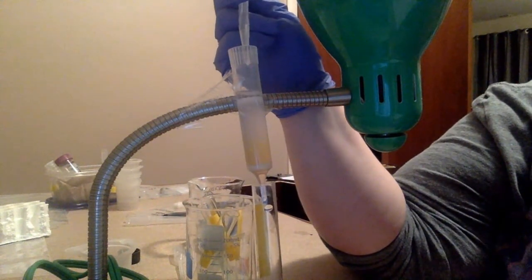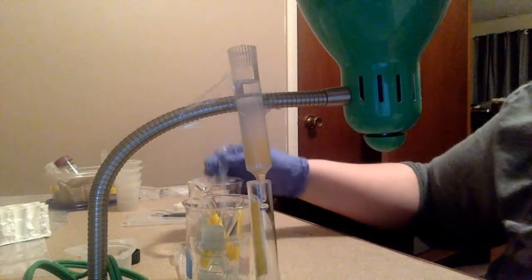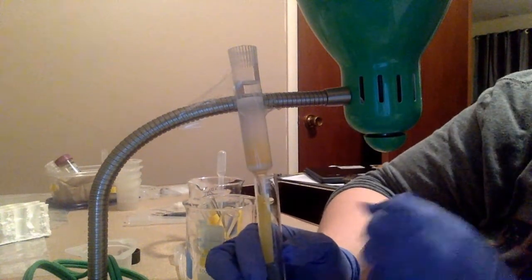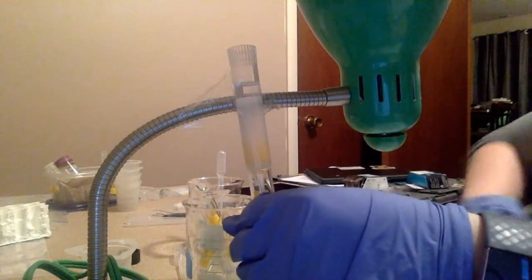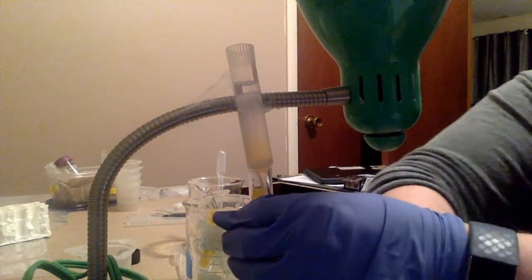You might be able to see. And now I only have that one left. Since I only have one color left, I'm not terribly worried about going too fast because I only have one substance left. My goal would have been not to cross-contaminate.